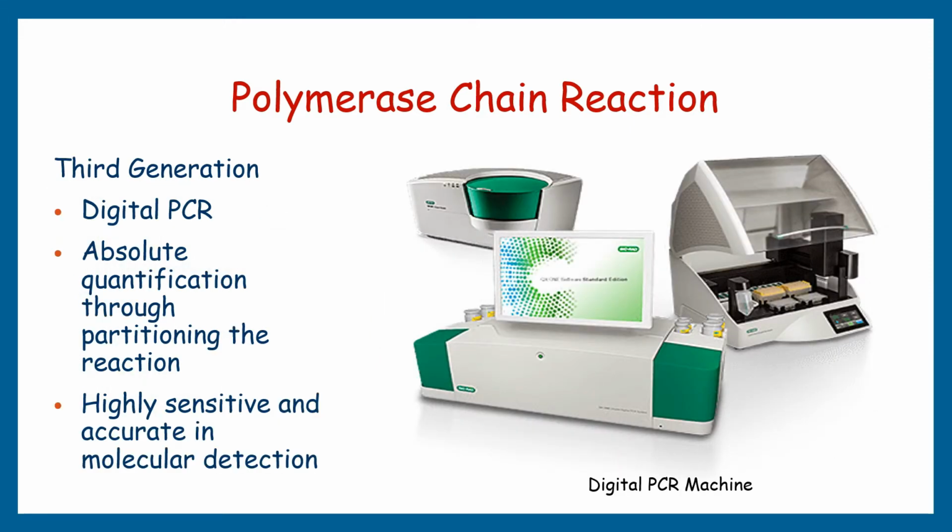Digital PCR is the third generation of PCR that enables absolute quantification through partitioning the reaction. They are highly sensitive and accurate in molecular detection. Before going to talk about its fundamental working principle, I would like to discuss in short about its history.